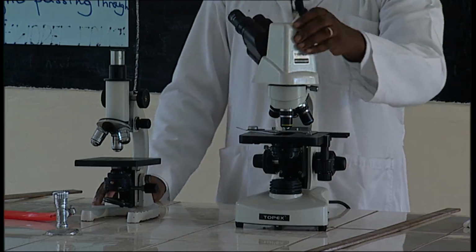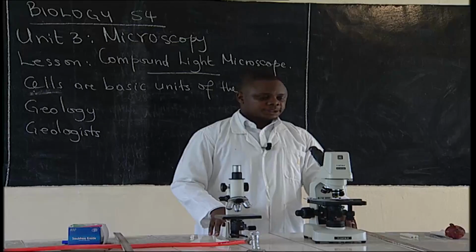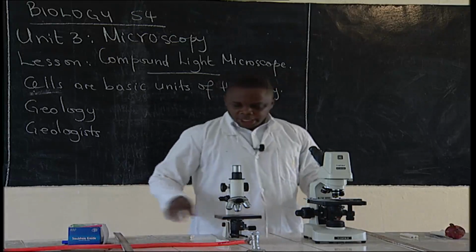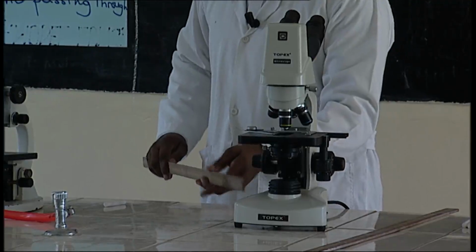Now, these microscopes have different parts which perform different functions. Let us talk about parts one by one. Here, as you see down, this part, we call it base.